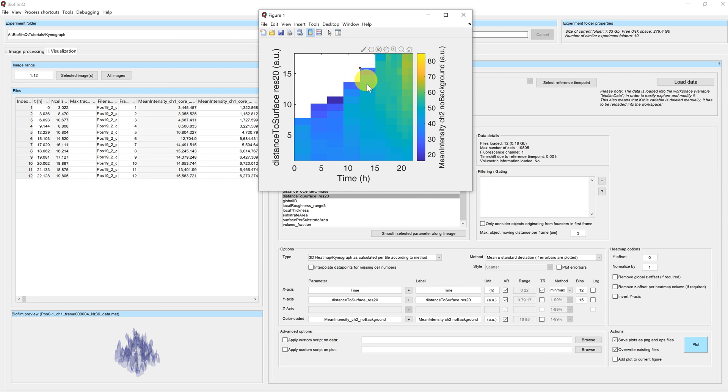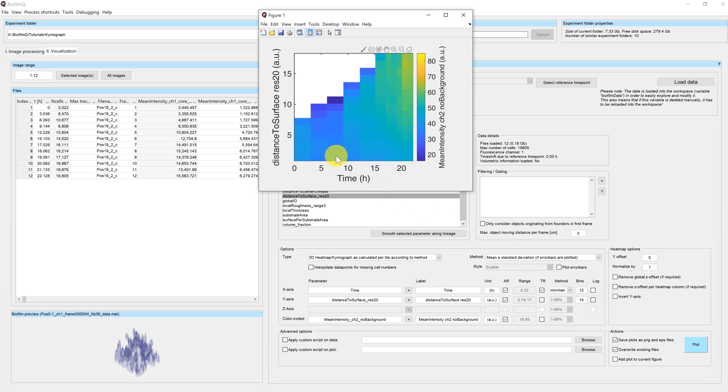This is counter-intuitive. And therefore, we're going to apply the invert y-axis option here, which will turn around or which will invert our columns.